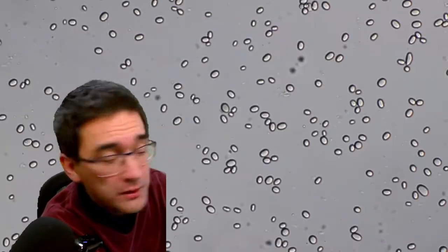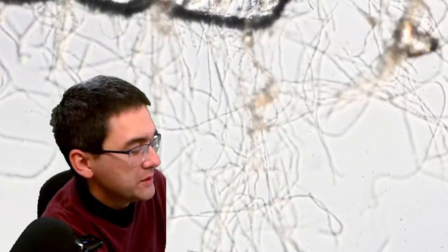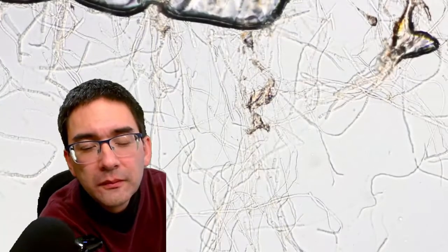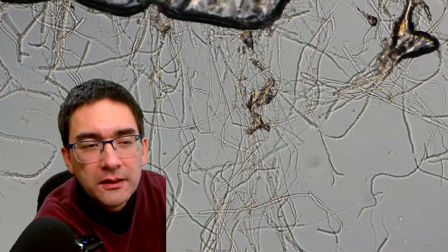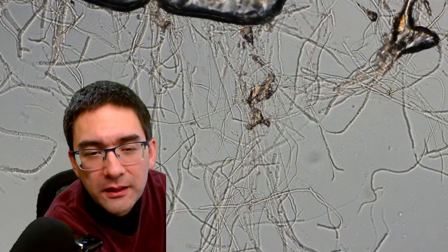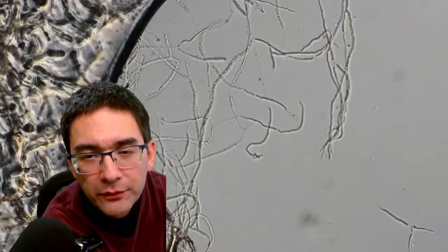The density of spores here is not so high anymore. So what I'm going to do now is lower the magnification again a little bit, going to now move over to the other one, the white fluffy stuff. Let's see what we have here. Here we go. I need to also refocus a little bit here. So these are basically the mycelium, these are the long thread-like cells that you see here, which is actually the main part of the fungus.